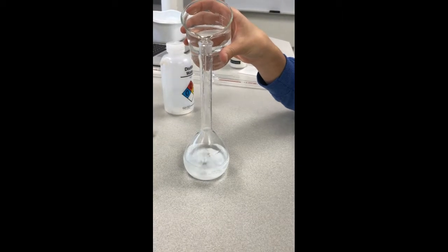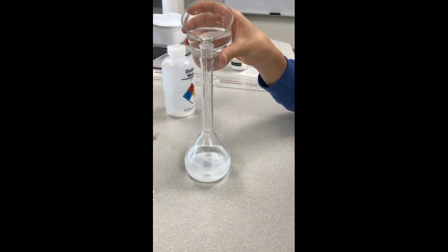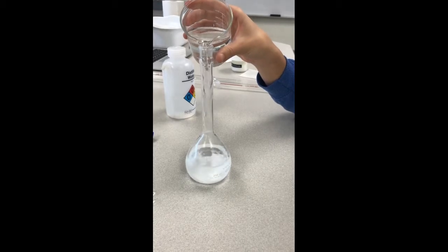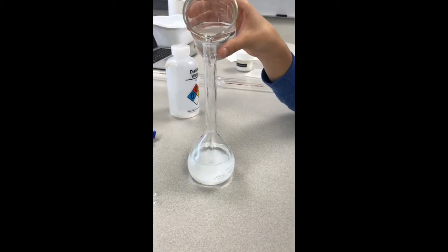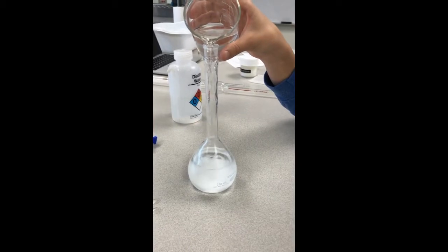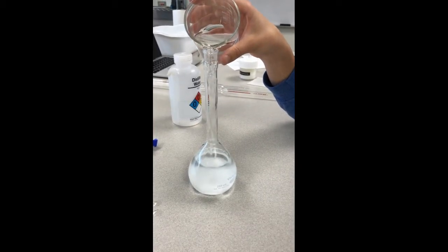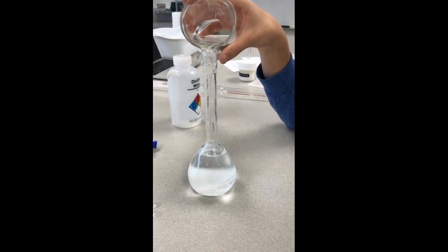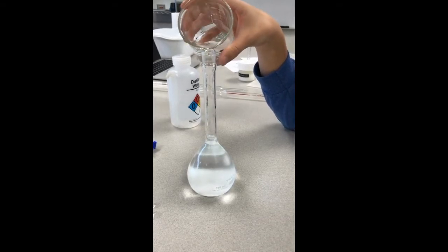We're going to fill the 250 milliliter volumetric flask with DI water. To make sure that we don't fill it past the line, once we start to get close to it, we're going to use a reusable pipette to fill it to the line so we get it as exact as possible.